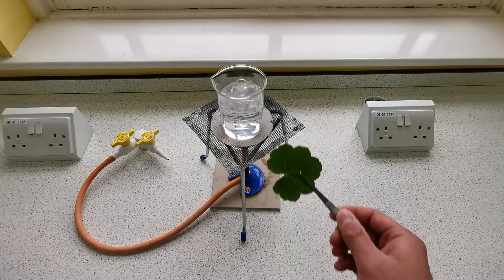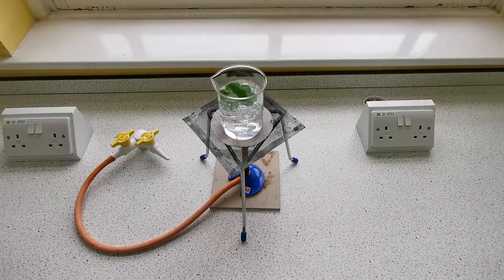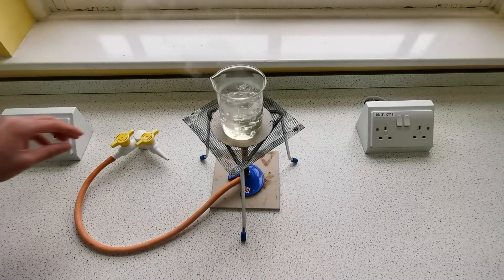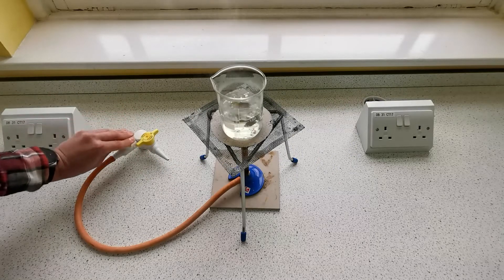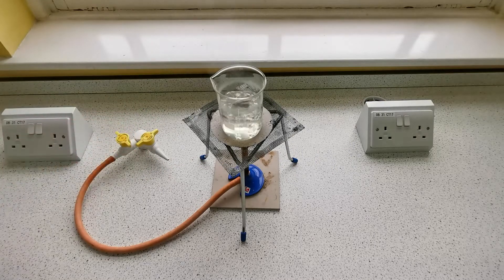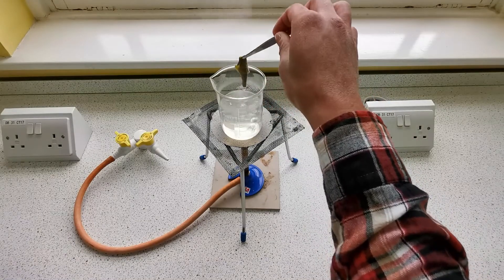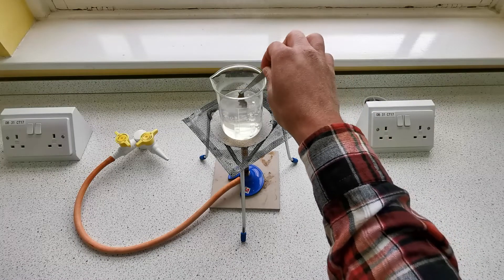Now that the water is boiling, we're going to put the leaf in and leave it to boil for about 10 minutes. Now that the 10 minutes are up, we're going to turn the Bunsen burner off. As you can see compared to before, the leaf is very soft — we've successfully softened the waxy cuticle.